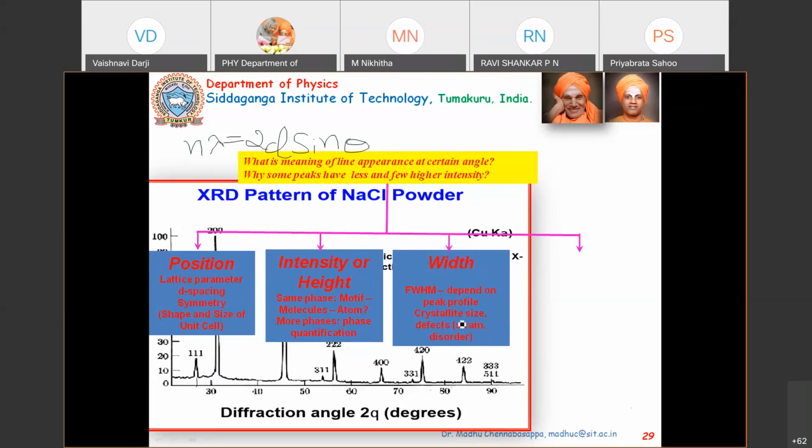A lot of this is used in, yes, your metal industry, like the stainless steel industry. Normally if they want to study stress, they take an X-ray of the unstrained material. That is called micro diffraction. They have a very narrow X-ray falling on a sample. Okay, so for example, it is falling on this spot, and this is your sample. Then they take it without applying any strain, and then they send the X-rays again. So they take this sample, put some load at this particular point, and then again do the X-ray diffraction. In this case, you can also know the strain induced in this lattice. So that is one of the uses of X-ray diffraction.